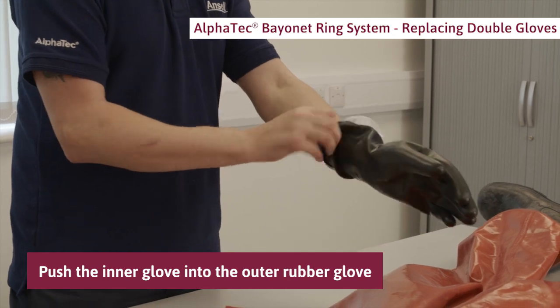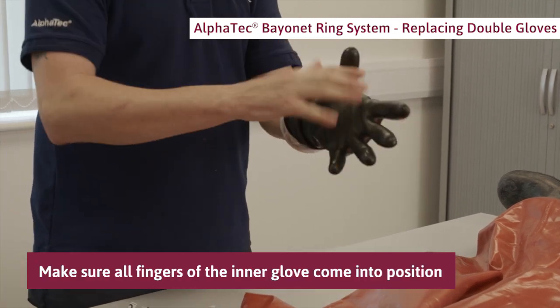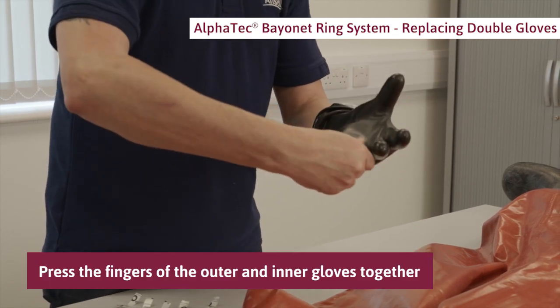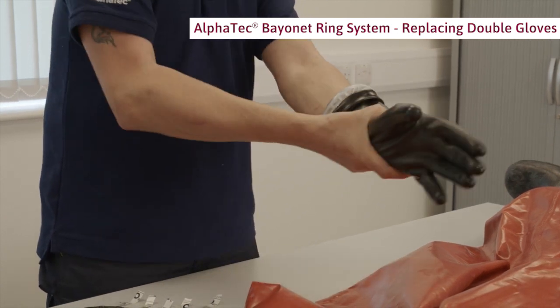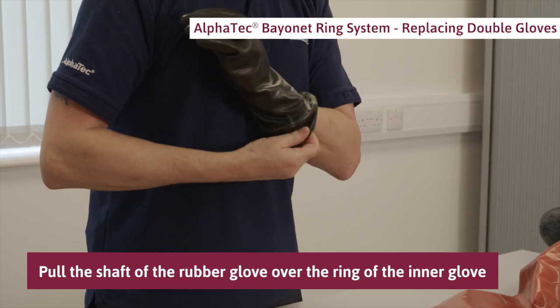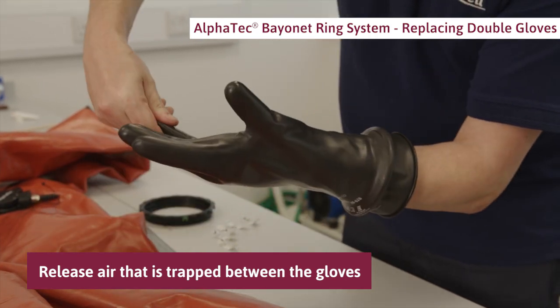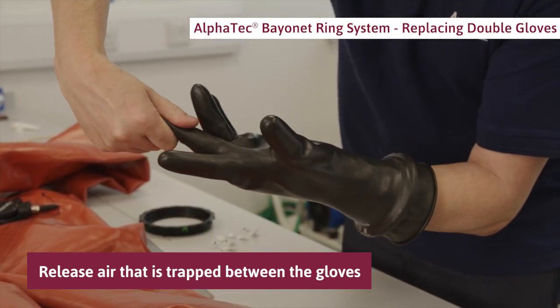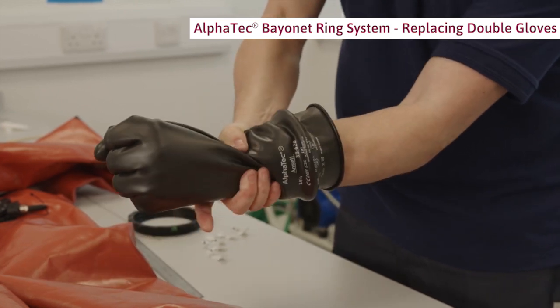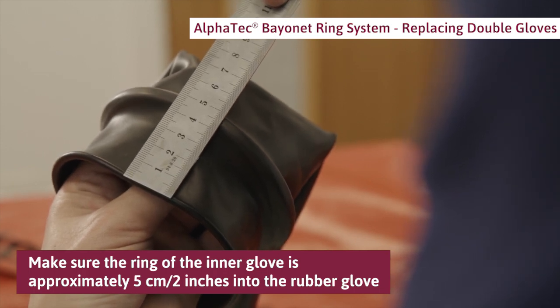Push the inner glove into the outer rubber glove. Make sure all fingers of the inner glove come into position all the way inside the fingers of the outer glove. Press the fingers of the outer and inner gloves together so that they stick together. Pull the shaft of the rubber glove over the ring of the inner glove and release any air that is trapped between the gloves.